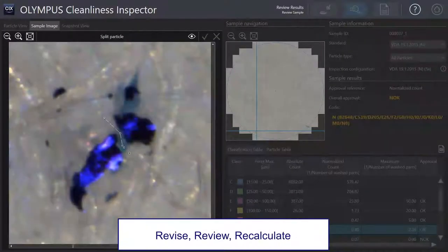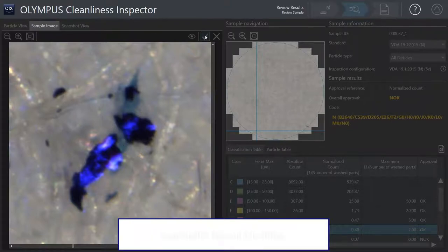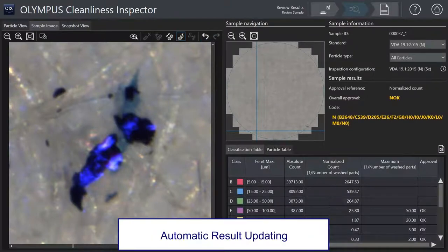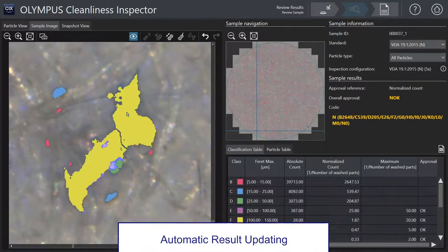When reviewing, revising, or editing, the results update and display automatically in all views and size classification bins.